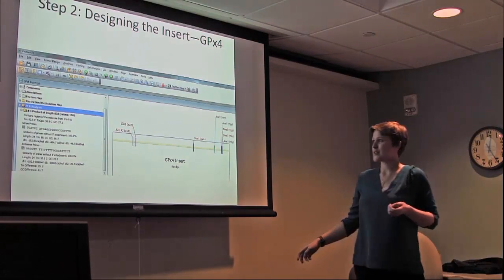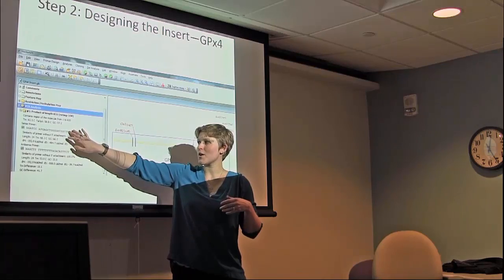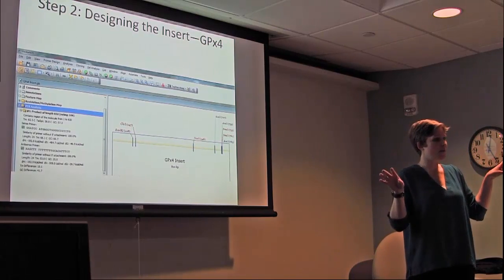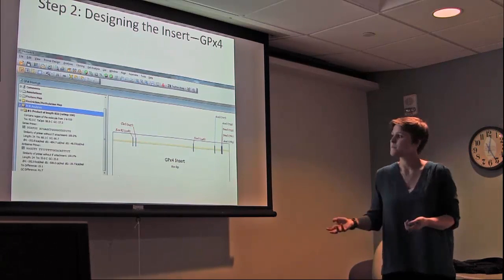And ultimately what it's going to do is design primers for you, which is really nice. So you've got your sense primer and your antisense primer, and at that point you can take these oligonucleotide sequences, submit them to Invitrogen, and have them produce your primers.